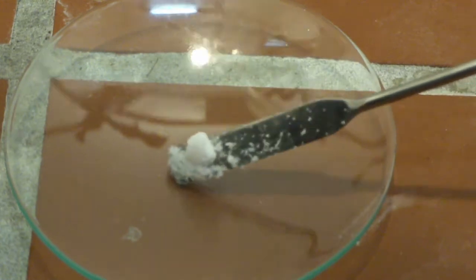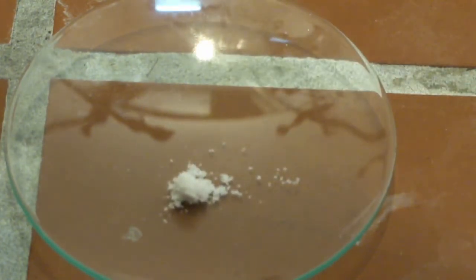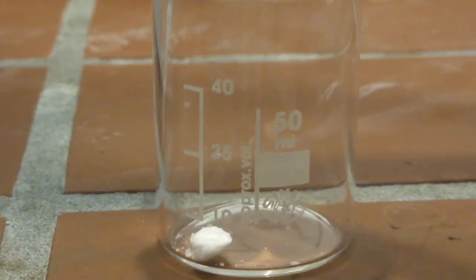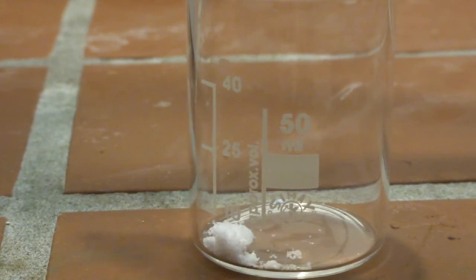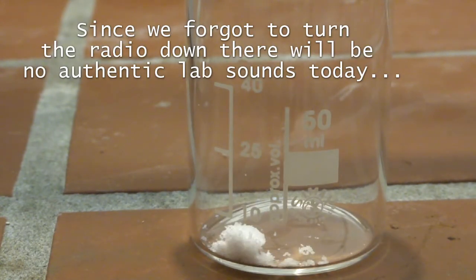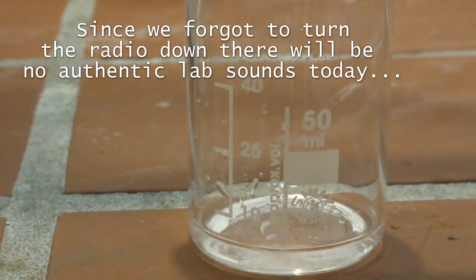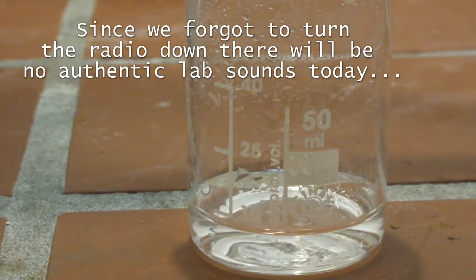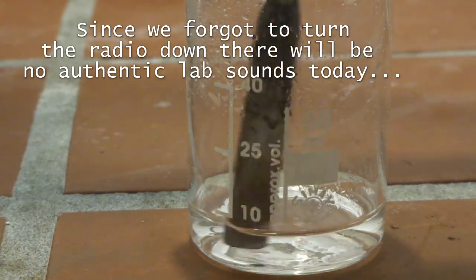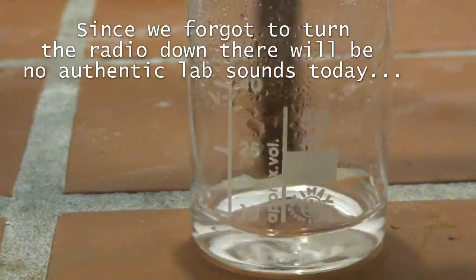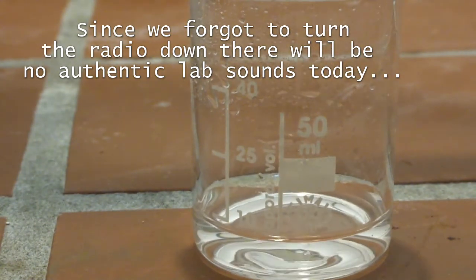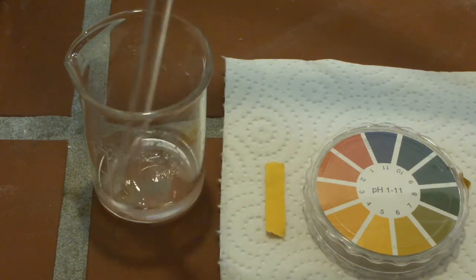Let's get started. Here is some para-toluene sulfonic acid. It is a white, slightly lumpy solid. As you might expect, it is a strong acid. To show this, we dissolve some of it in a little water. The thus obtained solution is strongly acidic.